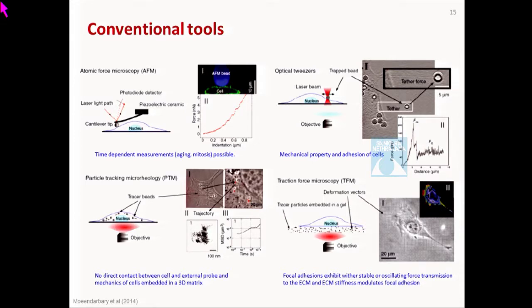And that is where you know that the cell is in contact. And then you start applying force. As you apply force, you observe the indentation depth and force relation. There are various models available. For example, you have the Hertzian model, where by looking at the deformation characteristics, you can also predict the Young's modulus. The force deformation characteristic can give you the Young's modulus of that particular cell. So that is about atomic force microscopy.